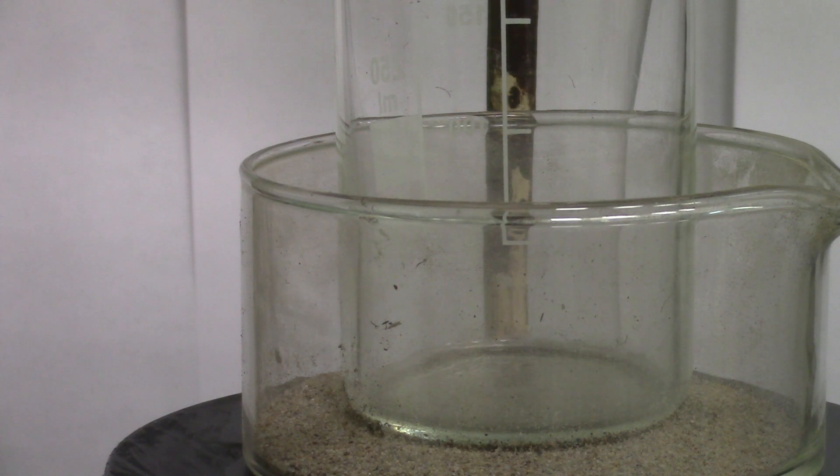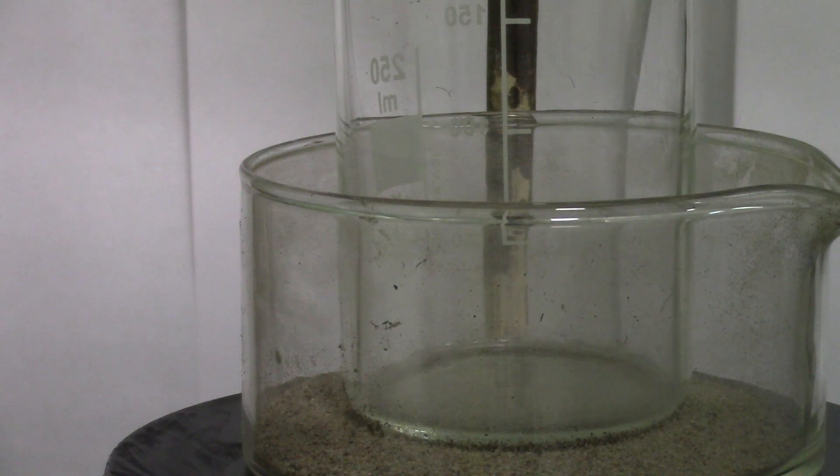First of all, put a beaker on the sandbath. It's essential to provide steady heating and cut off the need for magnetic stirring.